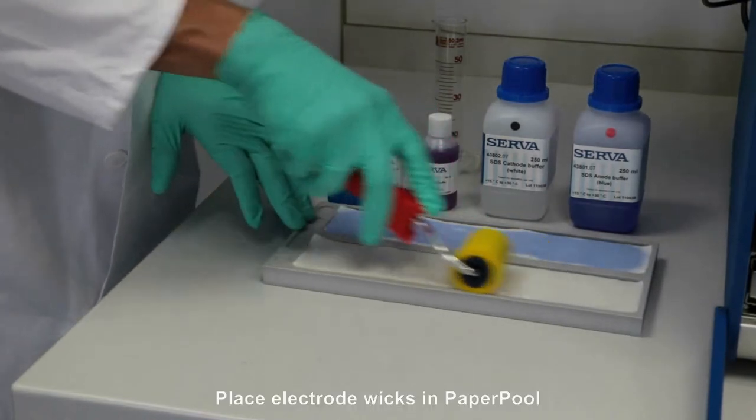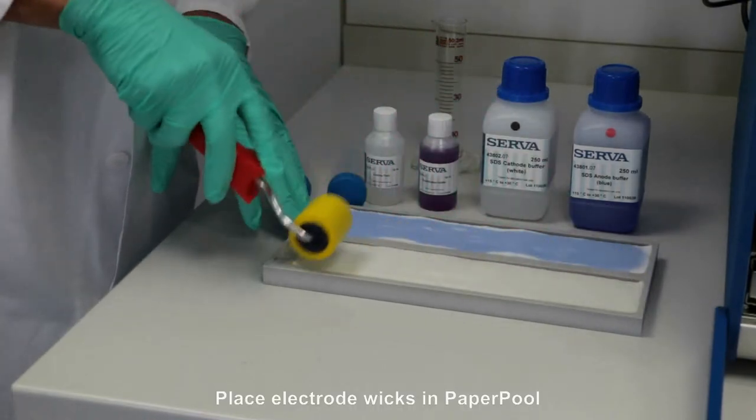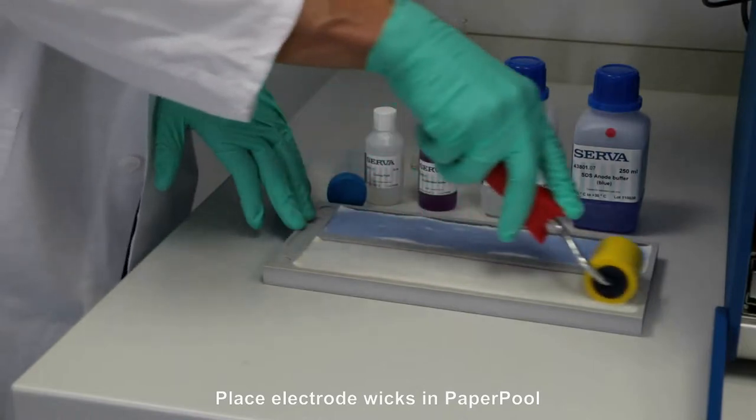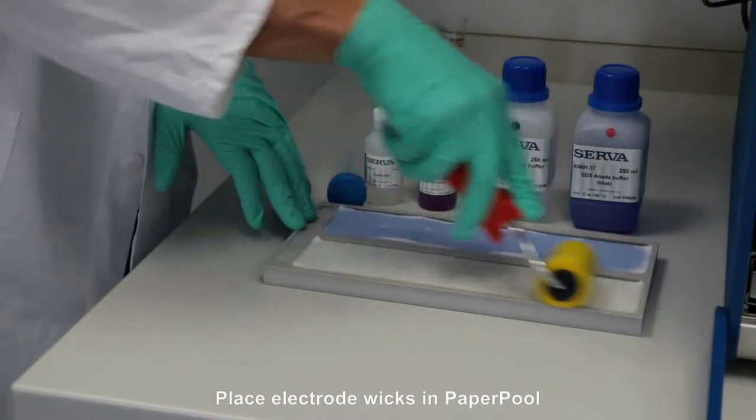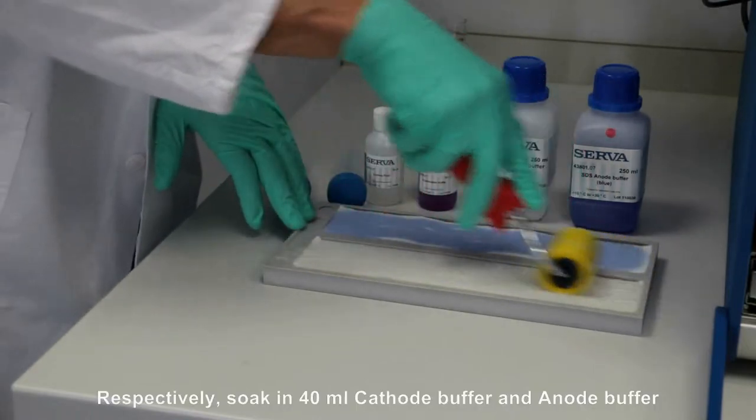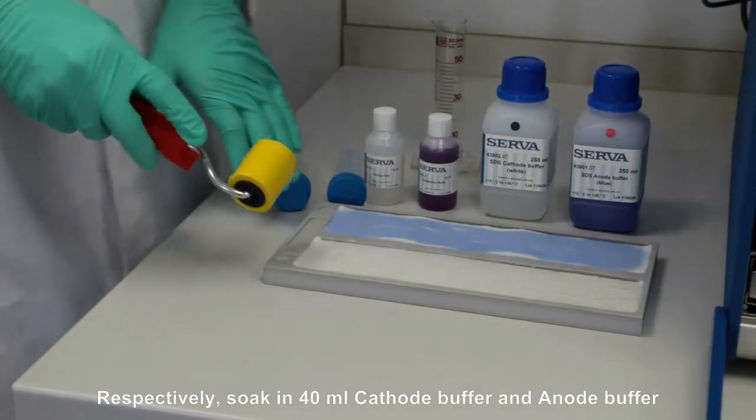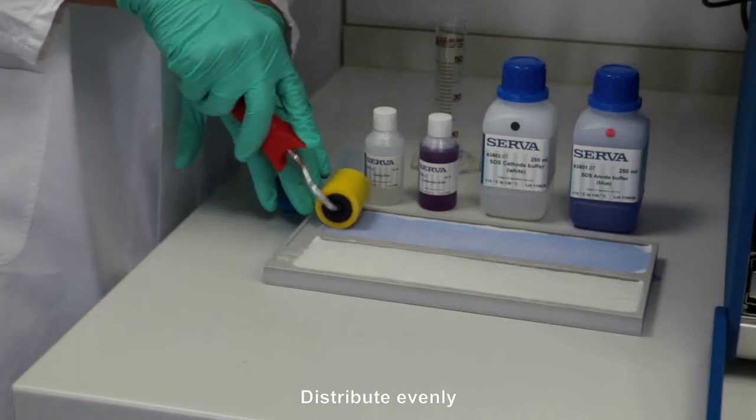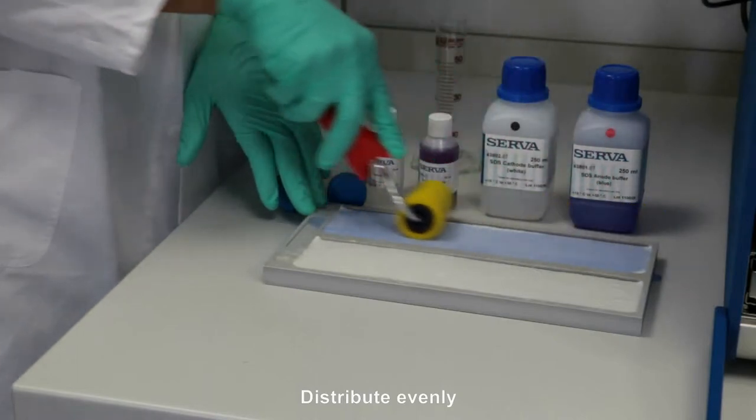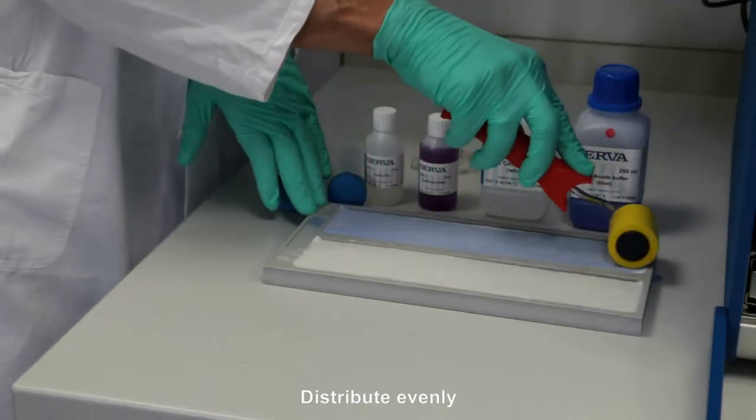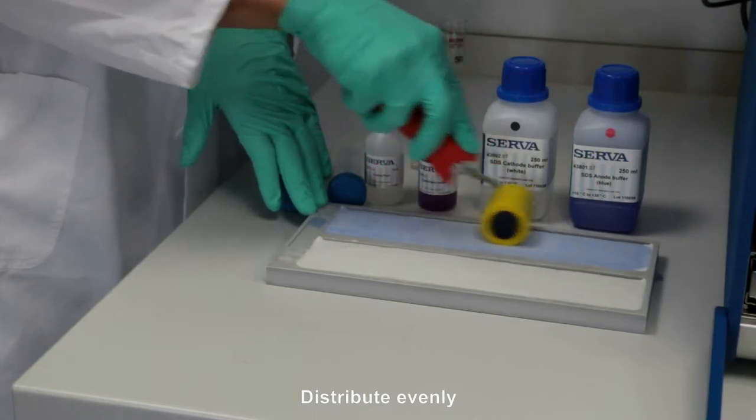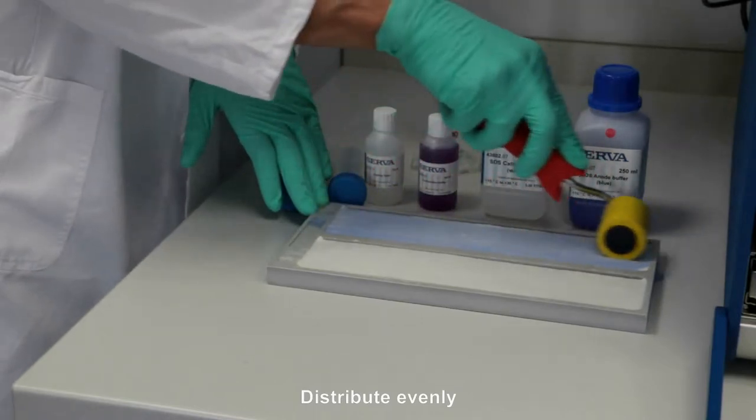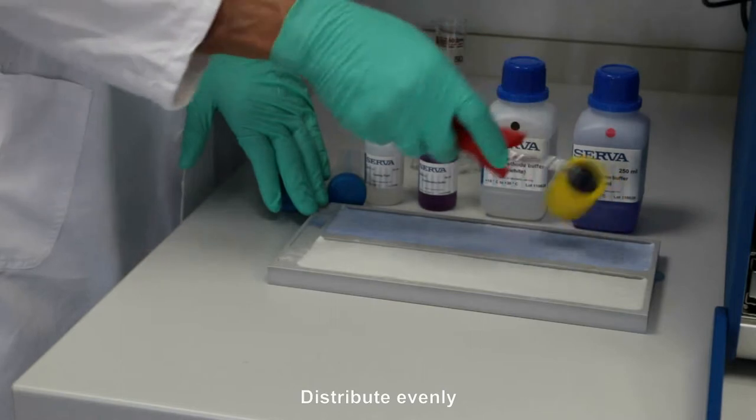During the focusing of the IPG strips, place one electrode wick in each compartment of the paper pool. Soak one wick with 40ml cathode buffer, the other with 40ml anode buffer. The anode buffer is stained to avoid a mix-up. Distribute the buffers evenly with the yellow roller. Avoid spilling blue buffer on the other wick.